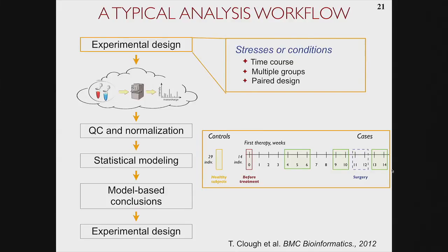So the question was, well, multiple questions. Between the healthy subjects and the disease subjects at diagnosis, which proteins change? Then if these proteins change, do they temper down and come back to the normal levels after the chemotherapy, or are they somehow affected by chemotherapy?